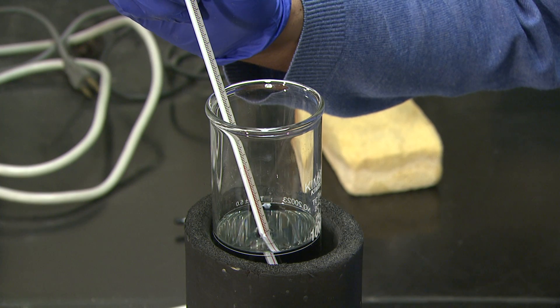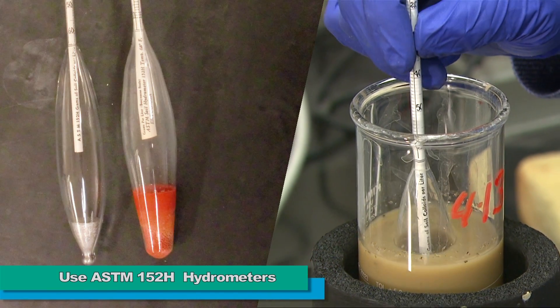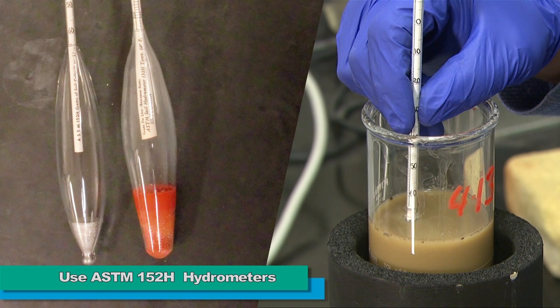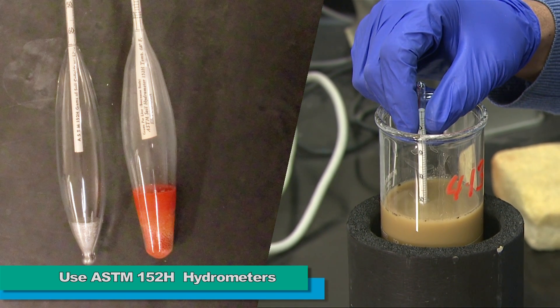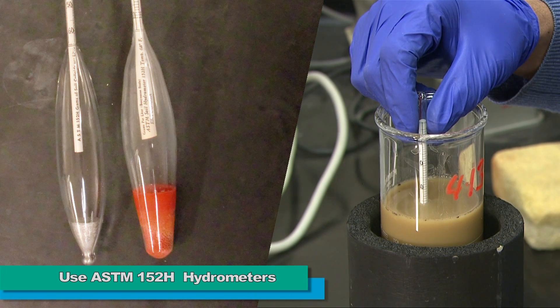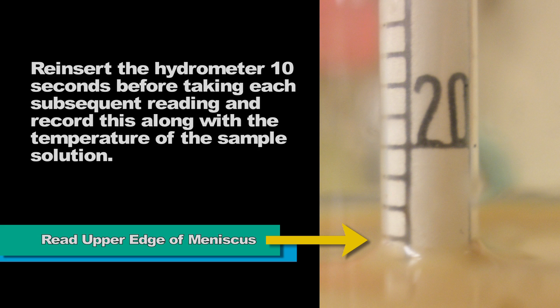About 10 seconds before taking the first hydrometer reading, gently lower the hydrometer into the cylinder. Let it slide into the solution and avoid having it bob up and down, which would make taking the reading difficult. Read the hydrometer at the upper edge of the meniscus surrounding the hydrometer stem. Leave the hydrometer in the solution after taking the 30 second reading, but remove it after the 60 second reading. Re-insert the hydrometer 10 seconds before each subsequent reading and record this along with the temperature of the sample solution.